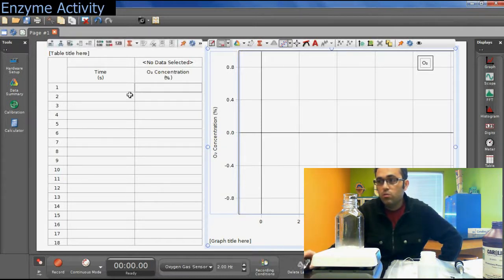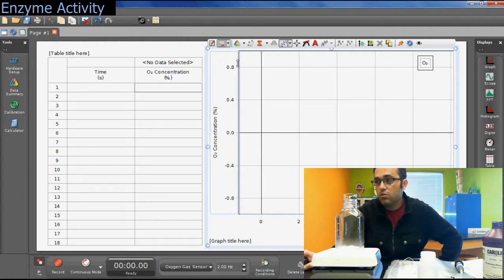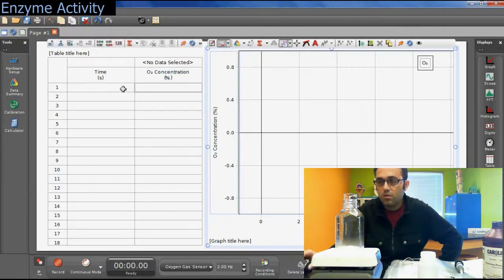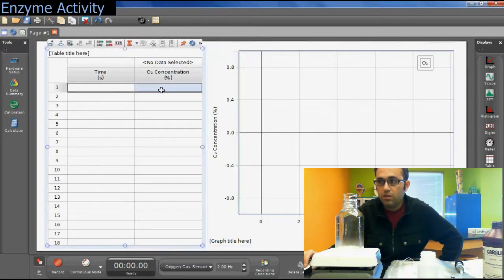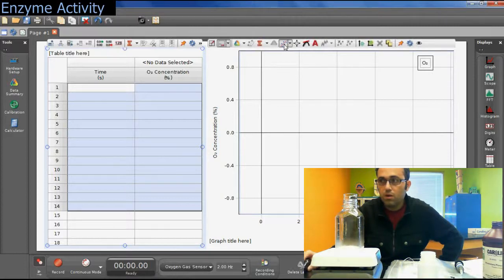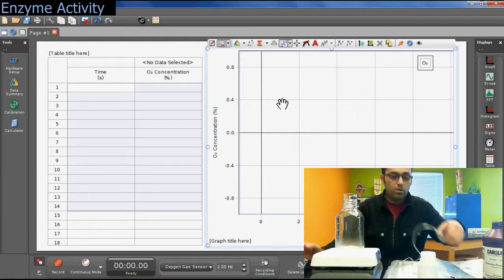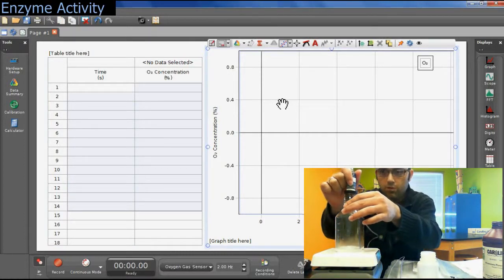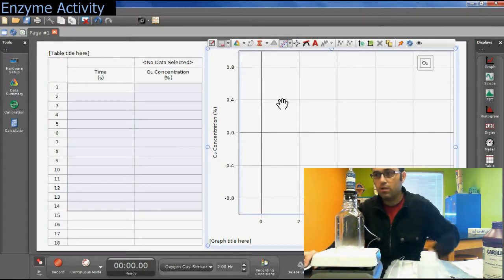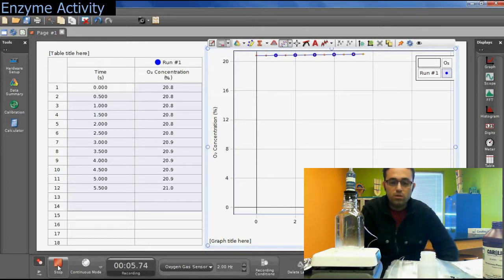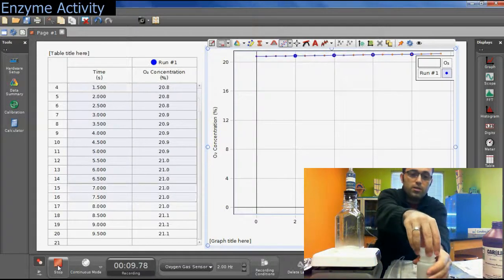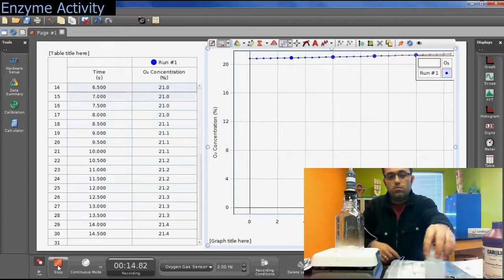While we're waiting for the one minute to pass, I'll show you some features of Capstone. You have your data table here — when data collection starts, you will see it running and your data plotted on the graph. When it's done, you will select all the data in your data table, go to your graph, and click on the best fit line to produce a best fit line of your plotted data. Go ahead and seal the container thoroughly and start data collection by clicking the record button. You can run it for 1, 2, or 3 minutes — whatever you want.